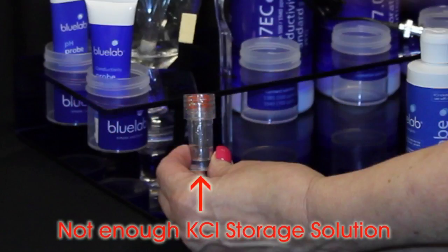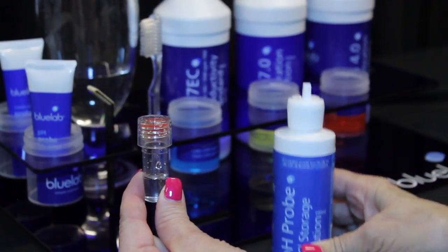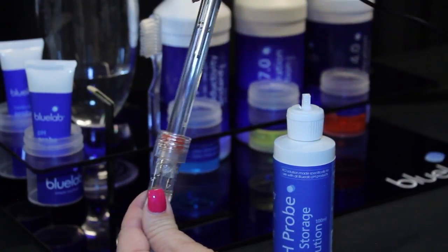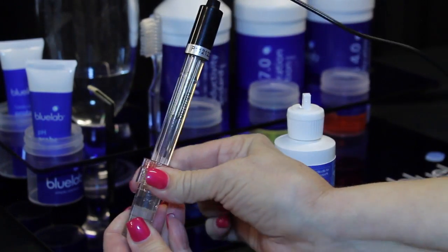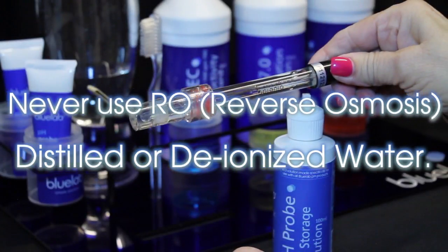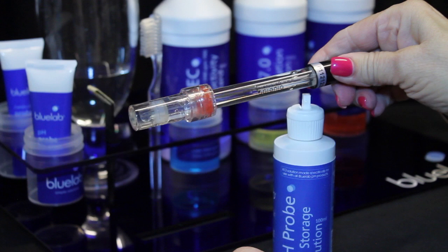Check that there is enough Bluelab pH probe KCL storage solution in the cap to cover the probe tip. If not, add KCL solution to ensure the probe tip will be covered. Place the cap back on the probe and twist the top counterclockwise to secure. Always store the pH probe in KCL storage solution. Never use RO water, distilled, or deionized water — pure water changes the chemistry in the probe, causing the probe to die.